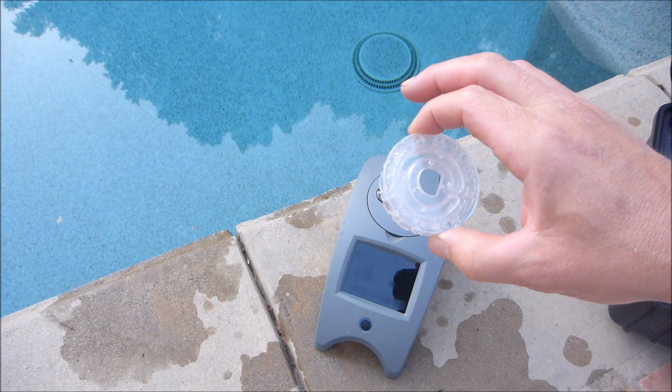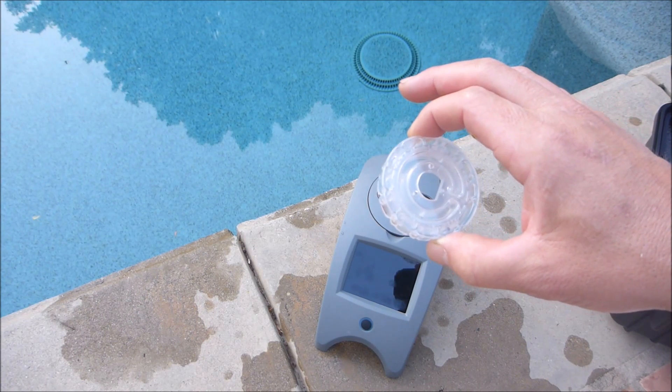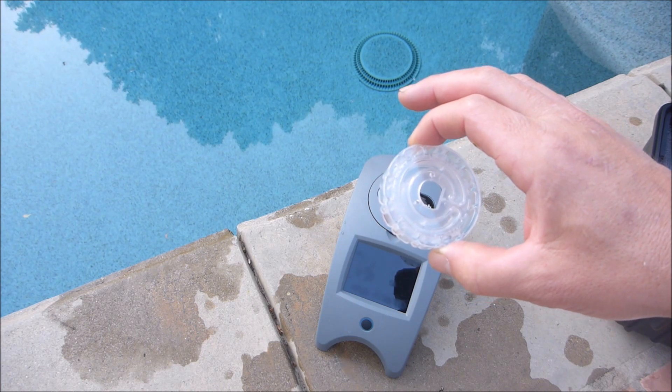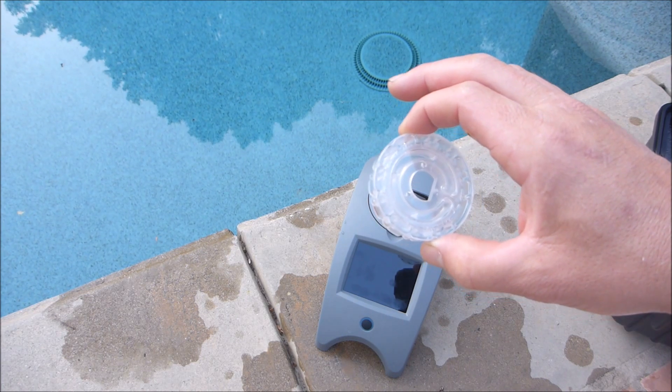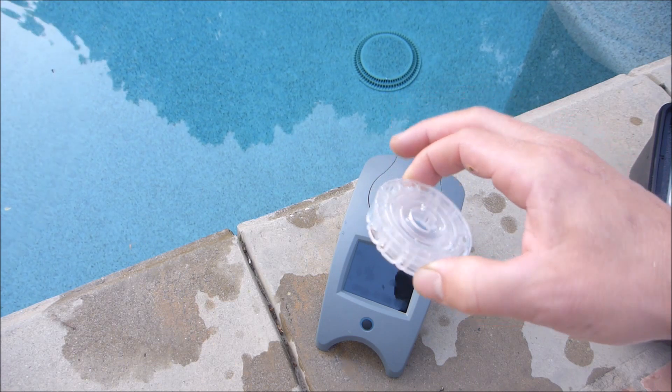The 202 series disc is their most popular. It does 10 test factors: free chlorine or bromine, total chlorine, total alkalinity, pH, salt, calcium hardness, copper, iron, cyanuric acid, and phosphate.